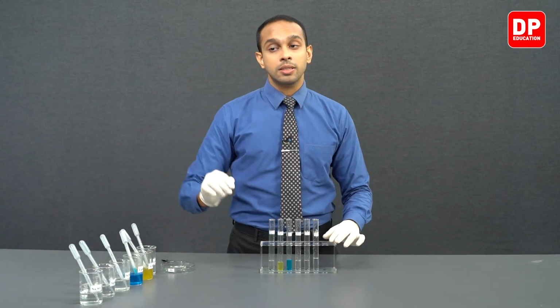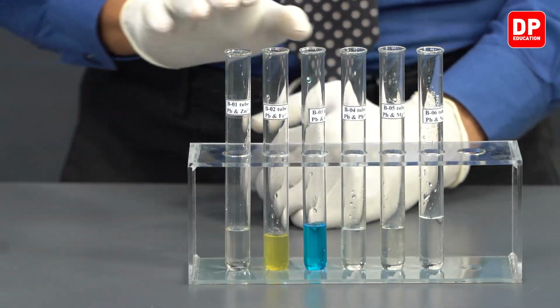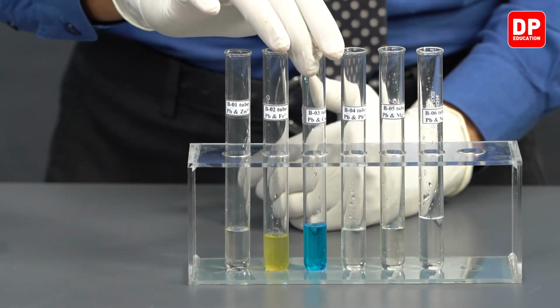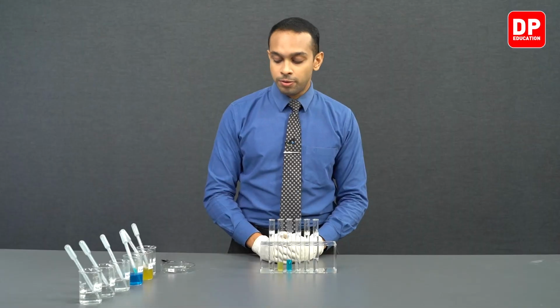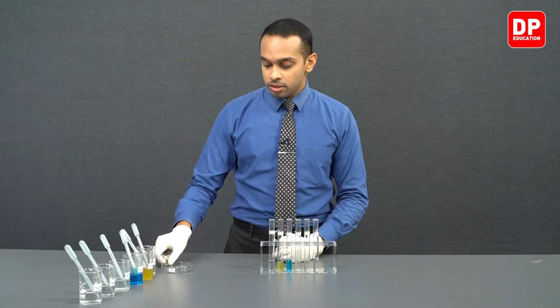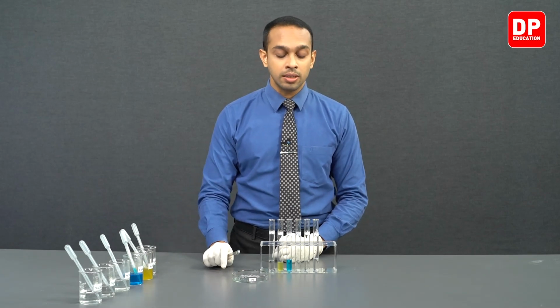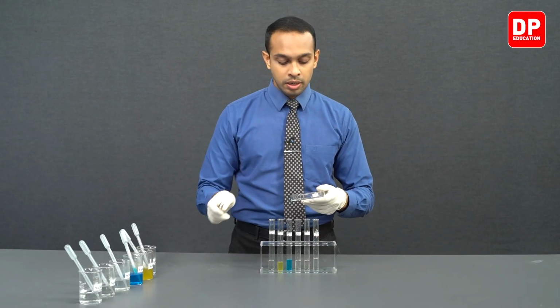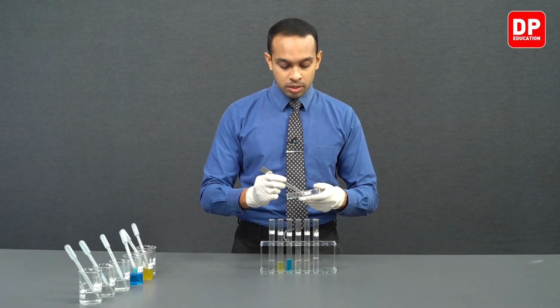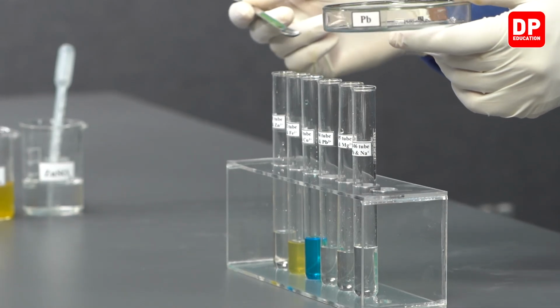Now students, after we have taken each of the different solutions into these different test tubes, it is time for us to add lead metal into each of these test tubes. So let's take a small piece or a small amount of lead metal into each of these test tubes.